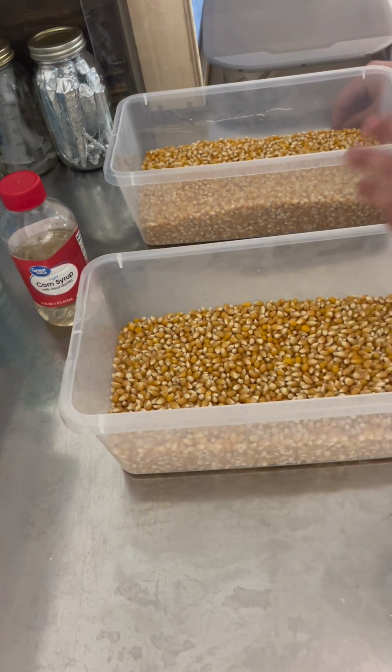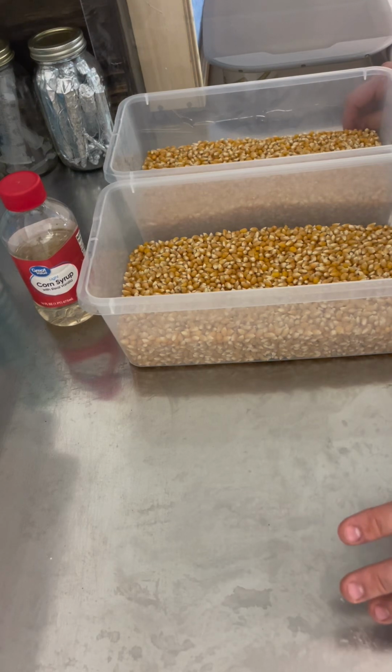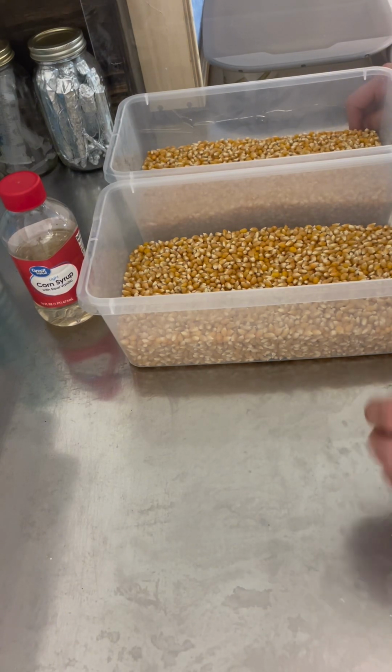I'm going to weigh every single jar so that they're exactly the same weight, and then I'm going to inoculate everyone with 5 cc's of the same liquid culture out of the same jar. And I'll take pictures of the jars, and we'll do a side-by-side at the end of it and see which one came out on top and by how much.